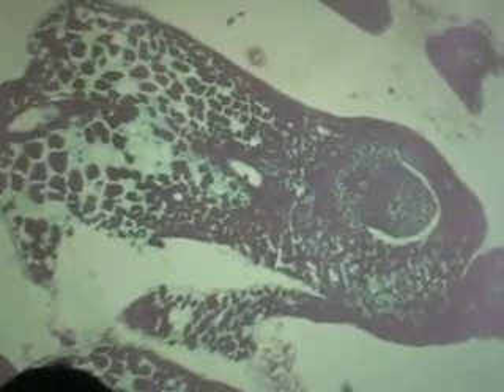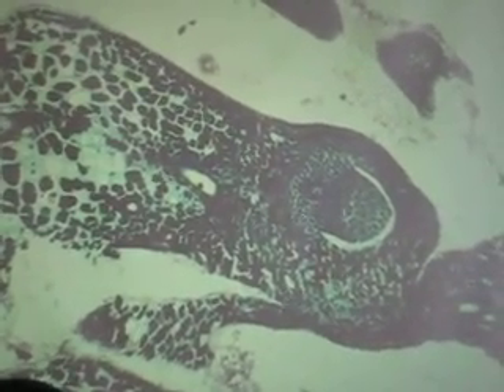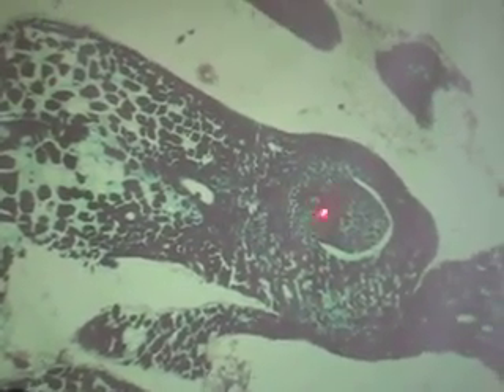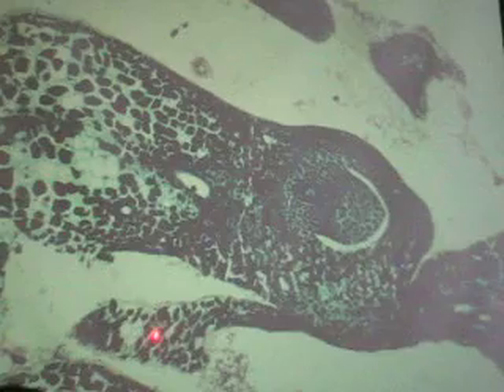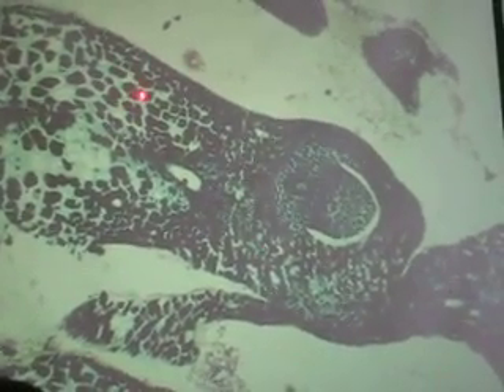Number 15 is going to have about 20 ovules. How many are going to be good? I'll tell you right now: one. So you're going to have to hunt down the right side of the cone and then hunt down the left side of the cone. How do I know that's good? Because I know what I'm looking for. First of all, that's a bract. That's the ovuliferous scale.